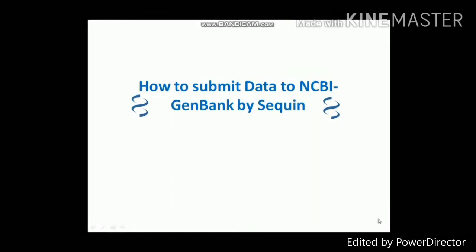Hi friends, in this video we'll see how to submit sequence data to NCBI GenBank using the Sequin tool.